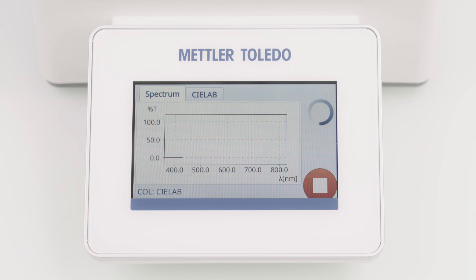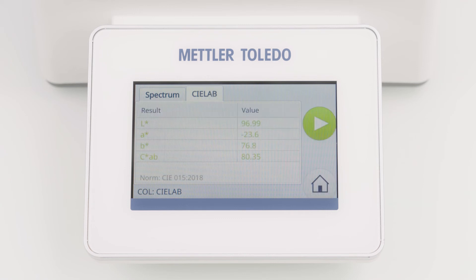Due to a flexible integration time, the measurement takes longer when the transmittance is very low. This feature ensures better repeatability and better accuracy of the measured spectrum. The results are displayed all in green, because result limits were activated and all results are within the defined limits.